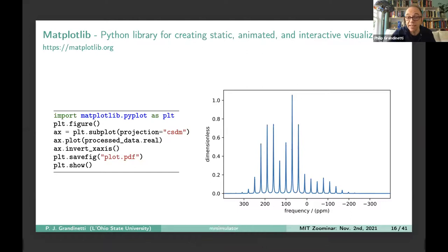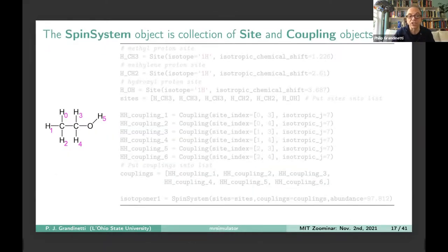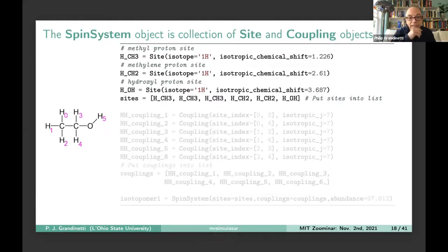So that's really it. Let me give you a few more examples just to show you some more aspects about how it works. A spin system object is just a collection of site and coupling objects. If I have something like everybody's favorite molecule, ethanol, and I want to create the proton spectrum for that, then I would create a site for the methyl protons, put in the parameters, a site for the methylene protons, and a site for the hydroxyl proton. I have created my sites, and I put my sites into a list. So I have 3 methyl protons, 2 methylene protons, 1 hydroxyl proton. And now I have my sites list defined.